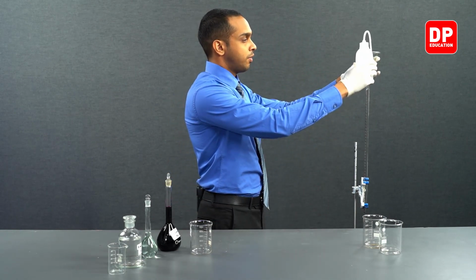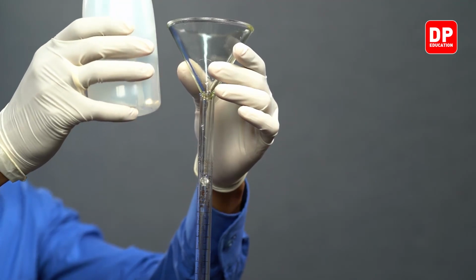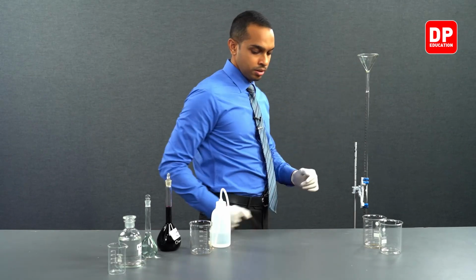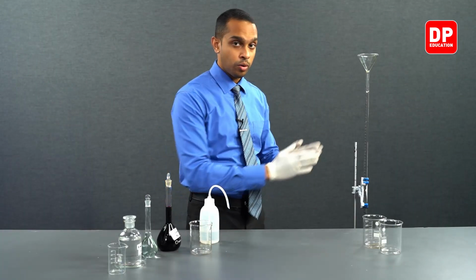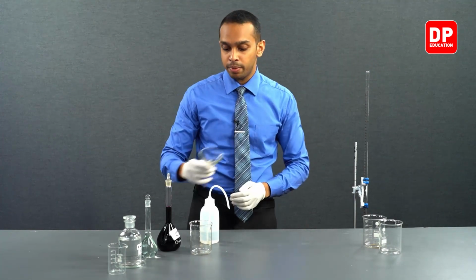Now I will be adding a little bit of water onto the burette. After transferring some water, I'll transfer some more. To show you all what needs to be done, I'll bring it back onto the lab table.